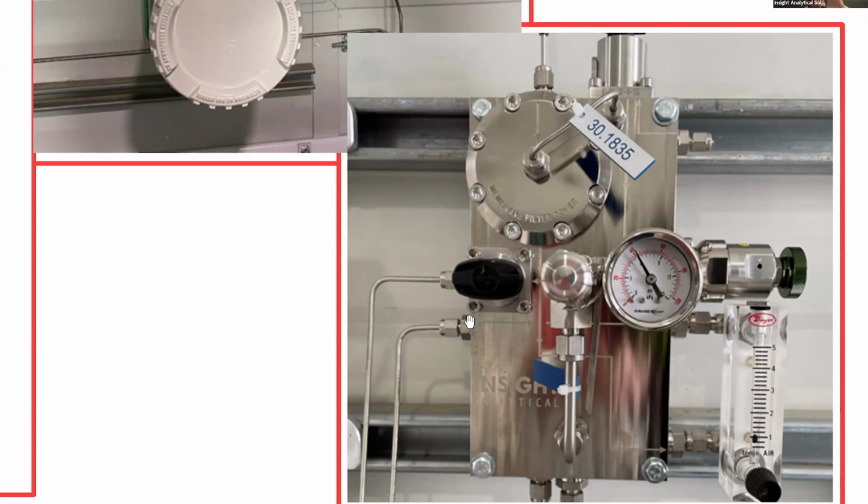The entire capabilities and flow paths of that system have been machined internally into the block, with the only external component being that pressure relief valve that you see there. So that's the entire sample system. It is about yay tall, a little bit bigger than my cell phone.